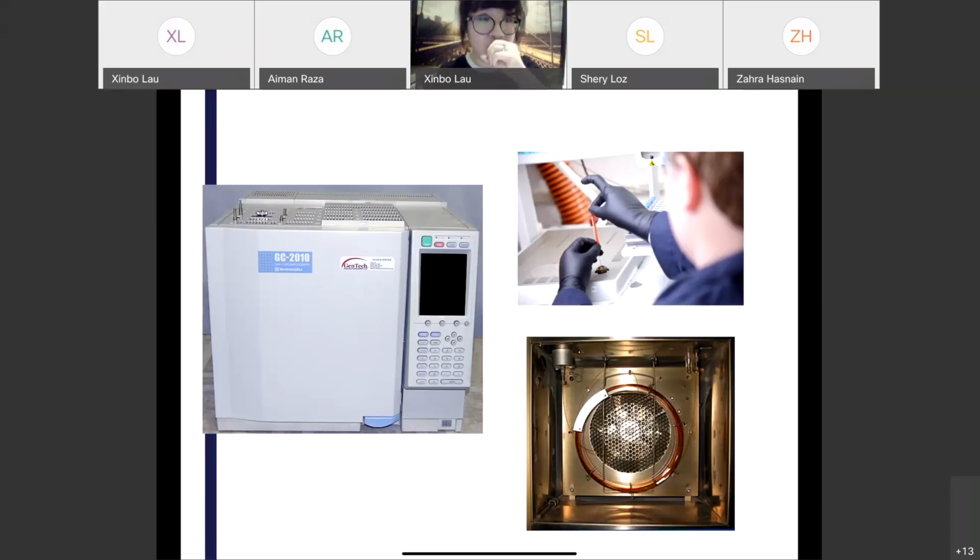Basically, you blow into the GC, and then it uploads the data to a central place for data treatment, and we'll see if someone has a certain disease. That's a project I worked on, which is quite interesting and useful.